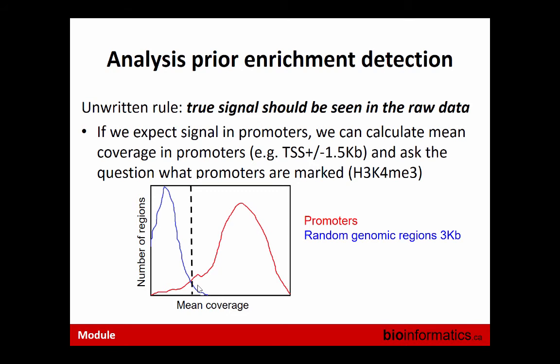So let's explain. I apologize, I probably should have put it on the slide. So this is our picture. We have the genome, and we have our coverage profile, which goes like that. And here we have genes. This gene transcribes this way. There is another gene which transcribes this way.